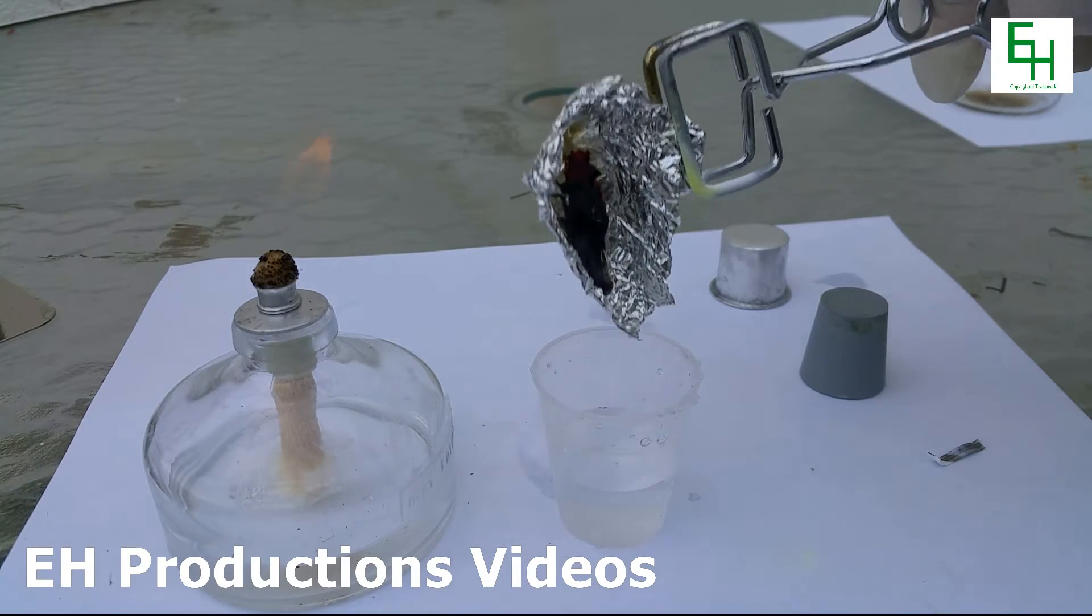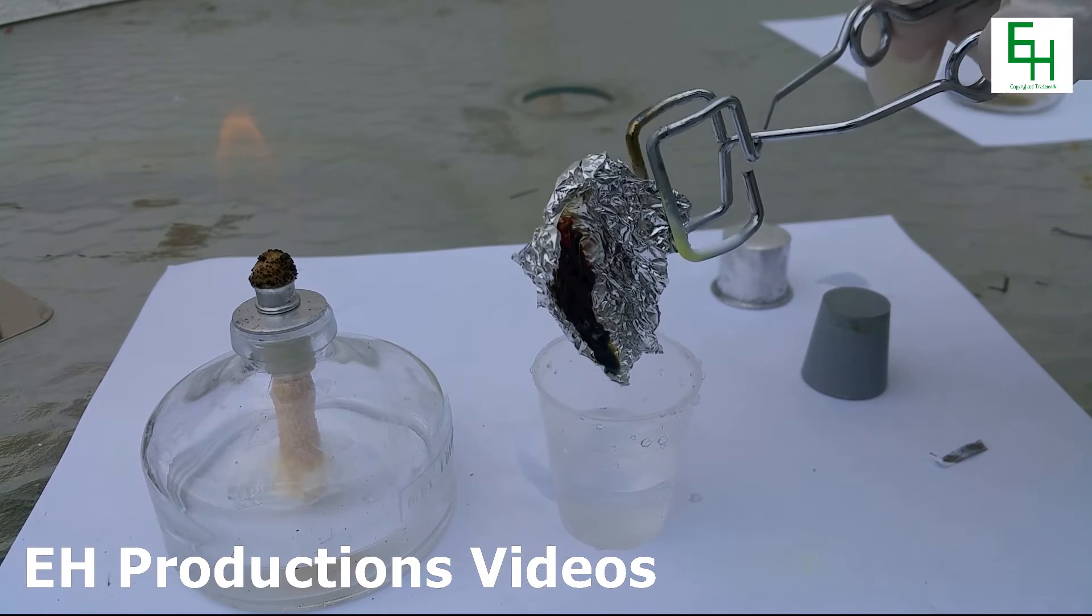Now I'm going to start pouring it. As you can see the melted sulfur is a very viscous liquid right now.